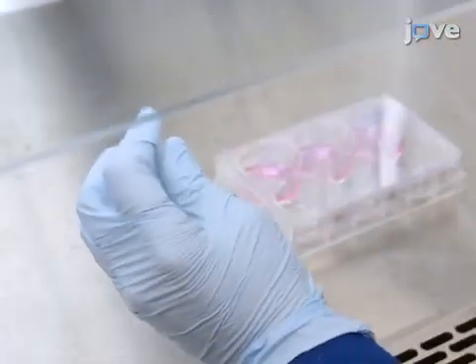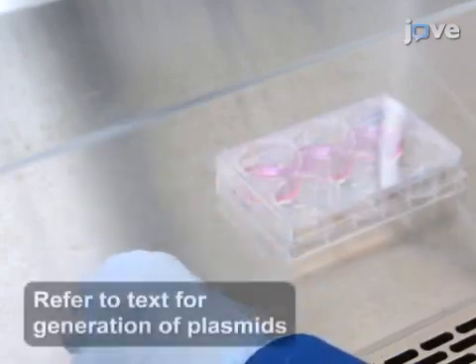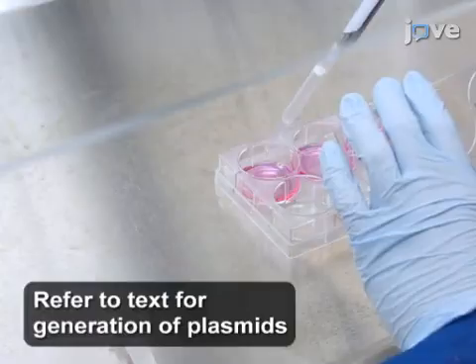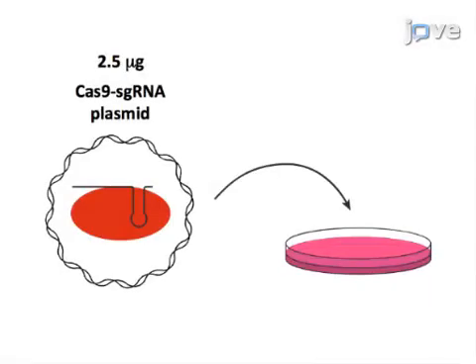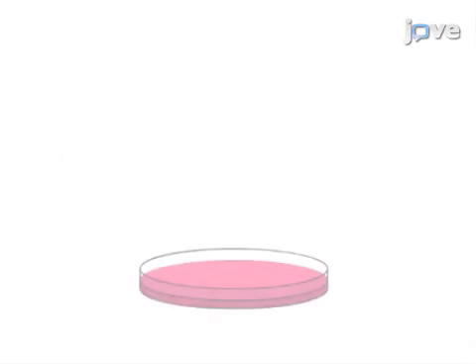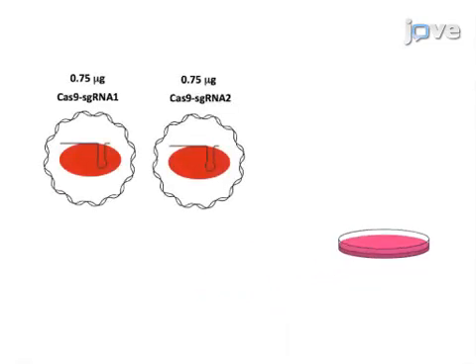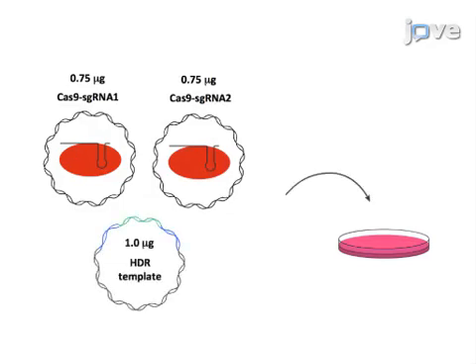Transfect the cells with 2.5 micrograms of total plasmid using a commercial transfection protocol. For transfection of cells without selection, use 2.5 micrograms of Cas9-SgRNA plasmid. For transfection of cells with selection, use 0.75 micrograms of Cas9-SgRNA 1, 0.75 micrograms of Cas9-SgRNA 2, and 1 microgram of homologous recombination template.